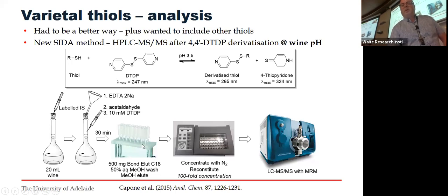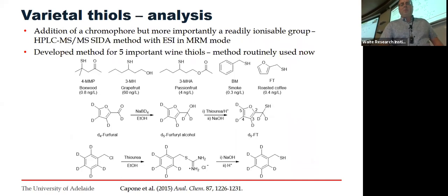Then putting it through SPE, basically a little bit of a cleanup, and concentrating down by 100-fold. Trap for the new players, make sure your SPE cartridges have sorbent in them or they're not going to do very much. Drying those samples down, reconstituting and analysing by HPLC with tandem mass spectrometry, using a particular method called multiple reaction monitoring, which I'll show you some chromatograms of in a minute so you can see how clean that is.